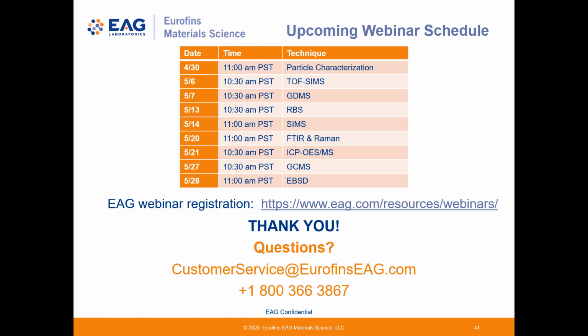Depth profiling analysis, both techniques are capable of doing that. XPS is also capable of measuring chemical bonding because the photoelectron peaks are much narrower. So you do see subtle peak shifts due to chemical bonding that Auger cannot detect. So XPS is a very valuable technique, and it's quite often used instead of Auger to look at surface analysis of samples. And we have a similar question comparing Auger to EDS.